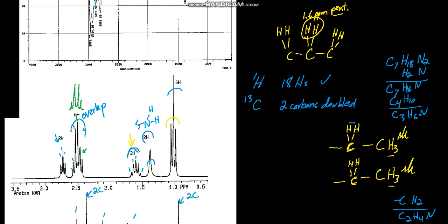Looking at the shielding, de-shielding, these signals are both pretty de-shielded. Here's where you could consult the tables. Notice I haven't consulted tables throughout this whole session, right?